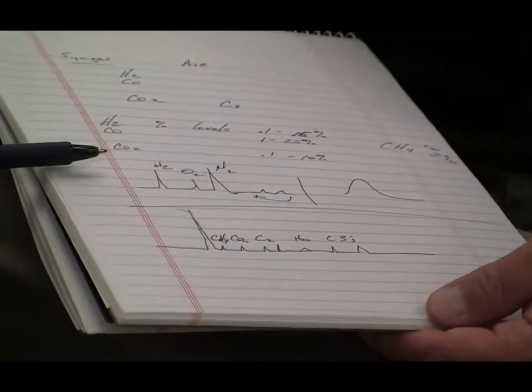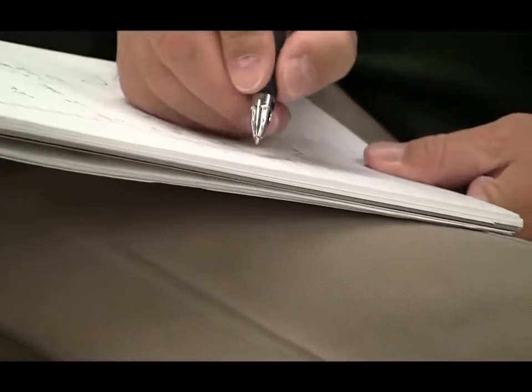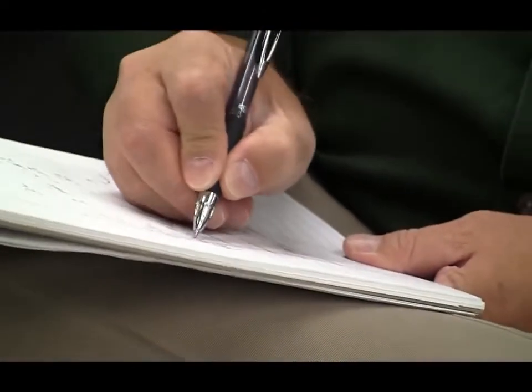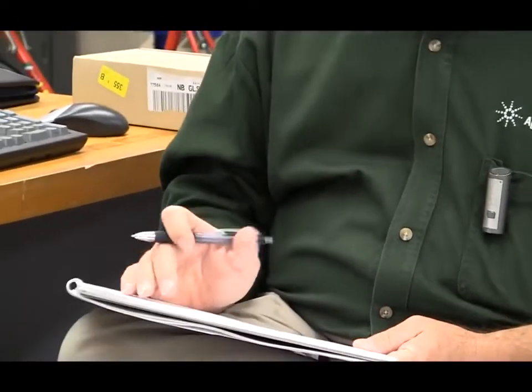This is for the PPQ. This is a mole sieve, the molecular sieve, Mole sieve 5A, and this is a porous polymer cube. So that's the basic principle of it.